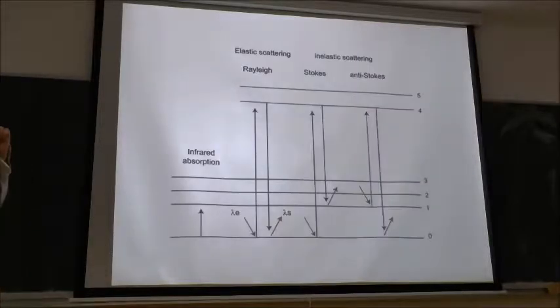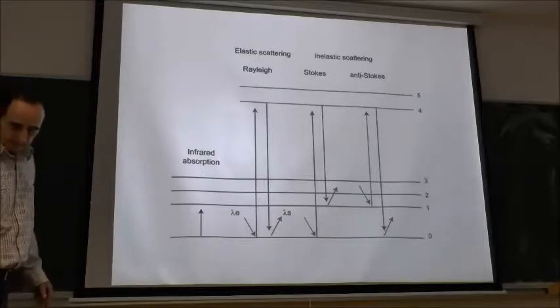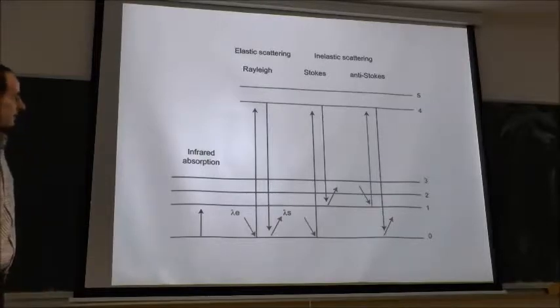So here we see the scheme of how light is scattered in matter.